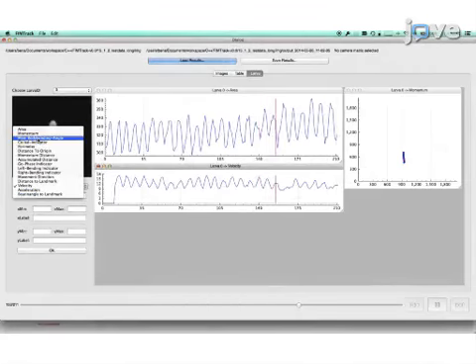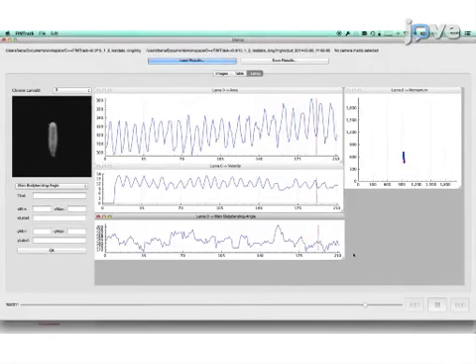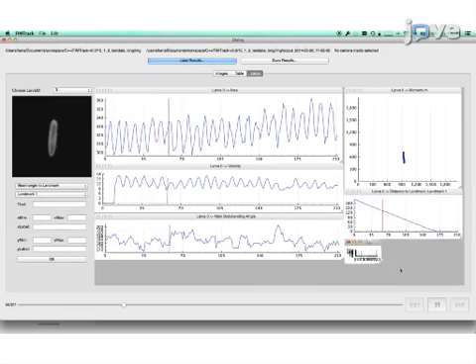The results show that precise, high-throughput, flexible, and easy-to-use quantifications of larval locomotion can be done based on the FIM imaging technique and the associated FIMtrack program. The main advantage of this imaging technique over existing methods, like using incident or transmitted light, is that only animals touching the surface are visible, resulting in a superb foreground-background contrast with no disturbing artifacts.